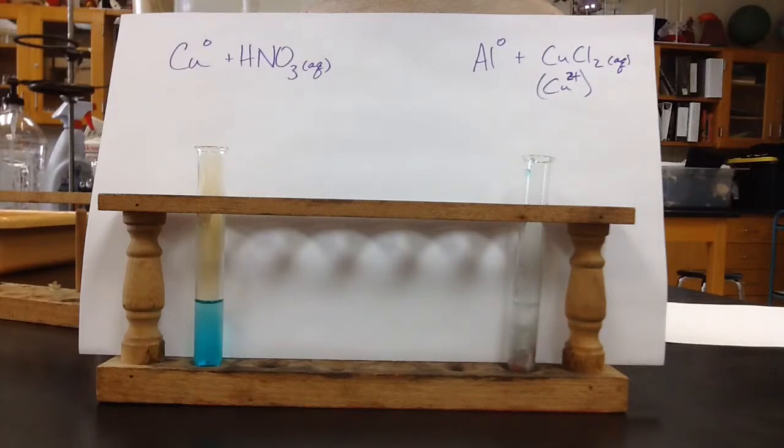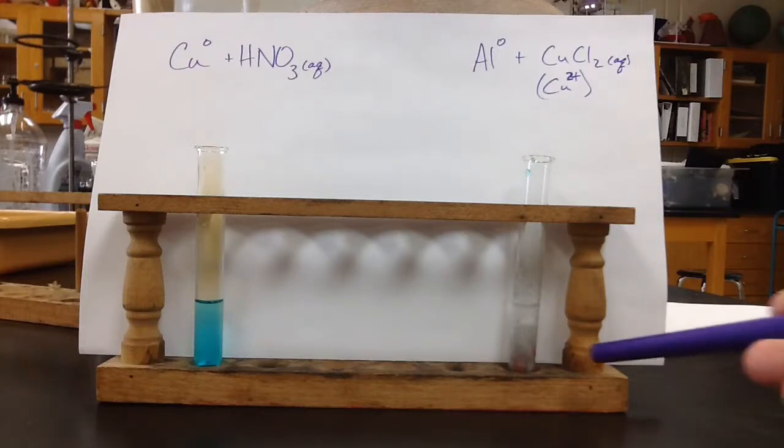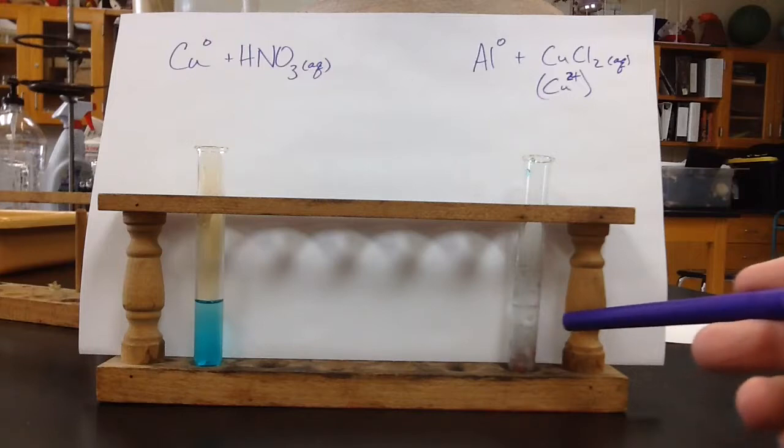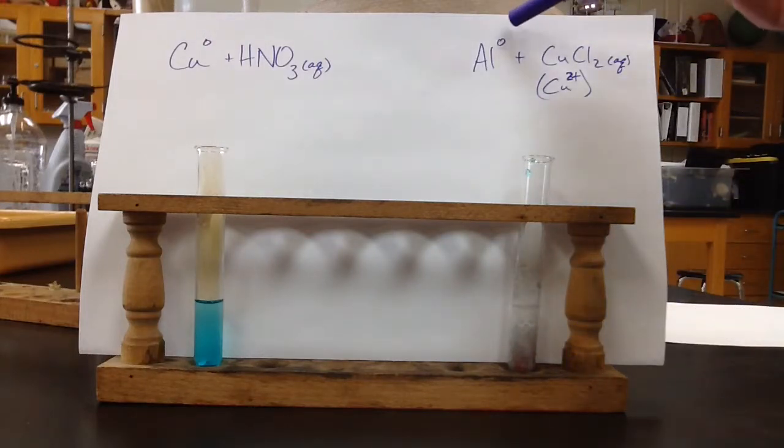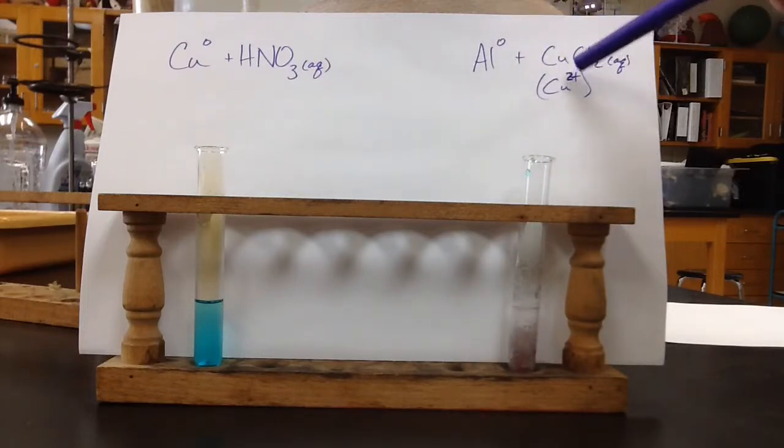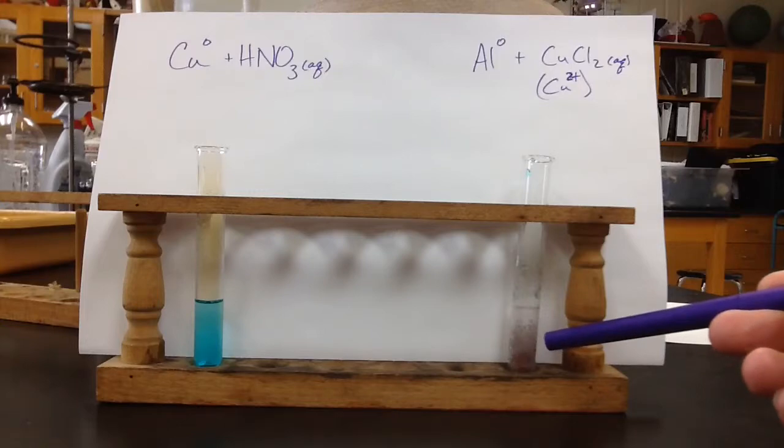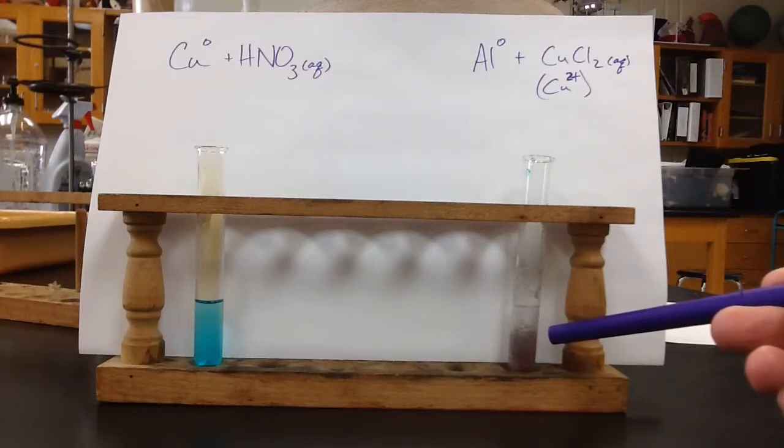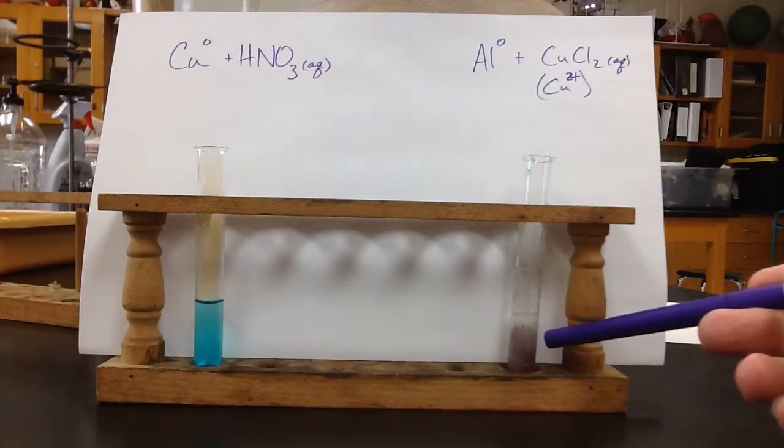On the right-hand side, what we can see happening is that our solution of copper chloride, which was a nice green color to begin with, it's now kind of becoming more clear. And what's happening is that the aluminum solid is reacting with these copper ions. And when this reaction happens, aluminum is actually giving electrons to the copper. So we had the copper ions in the solution, which gave us that nice green color. But as the aluminum reacts with the copper ions, those copper ions are now turning into copper atoms.